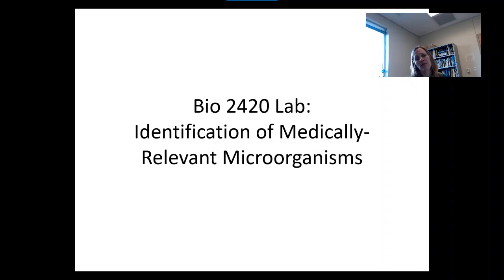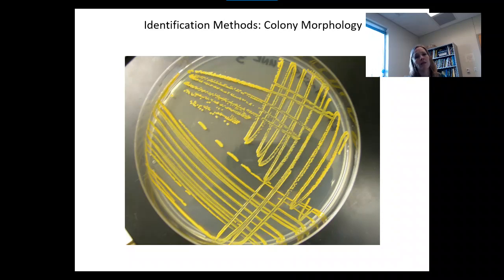So you get a sample from a patient, and the first thing you need to do is to grow up more of that organism so that you have plenty of it to work with. So the first thing that you typically do is to put that organism in media, or grow it on a solid surface of media. Remember, media is just a way of delivering all the food and nutrients the organism needs. And then you put it in the proper environmental conditions to multiply the organism. Here's an example of the bacteria spread across a plate, which is a typical media choice to multiply your organism.